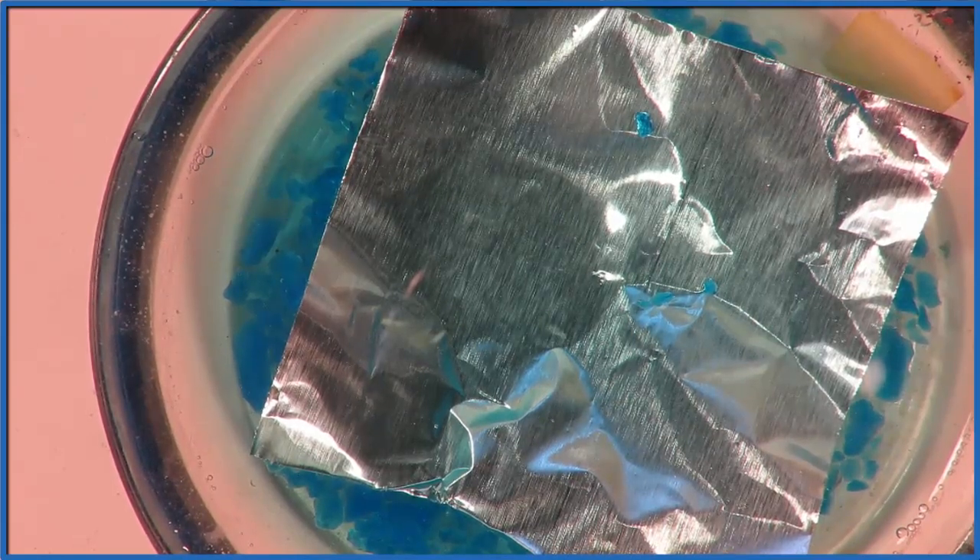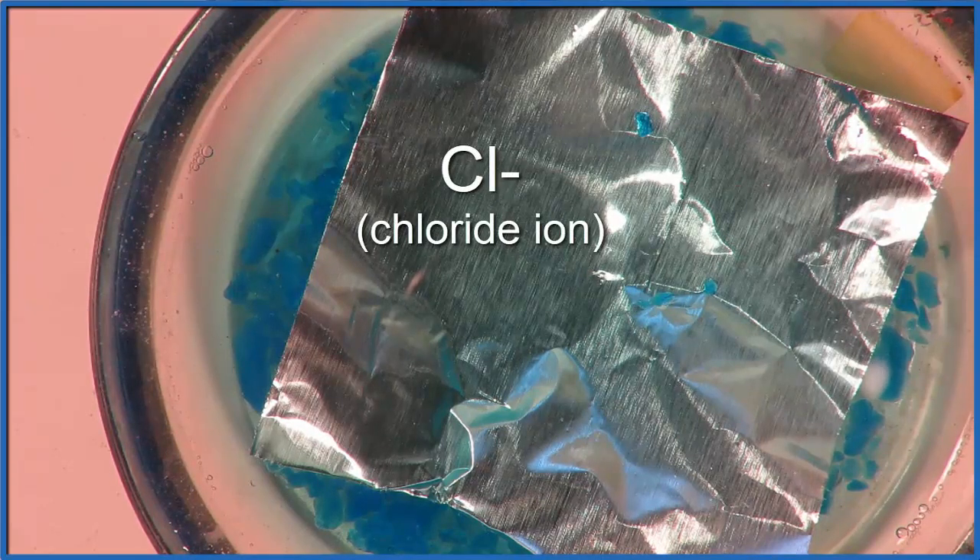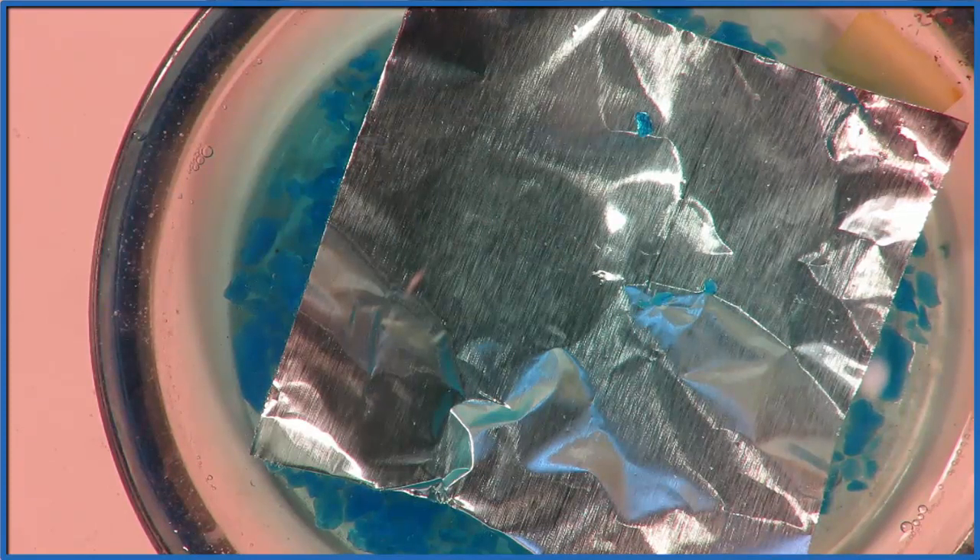So to speed this reaction up, if we add some chloride ions, Cl-, so we could add some NaCl — that would dissolve and we'd have these chloride ions — that really speeds the reaction up. It acts much like a catalyst would. So let's jump forward and do that.